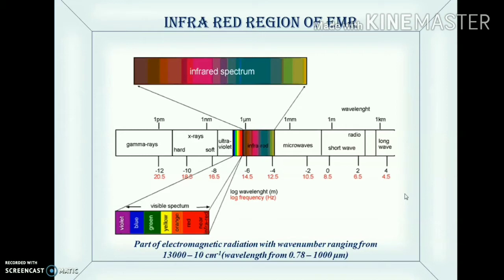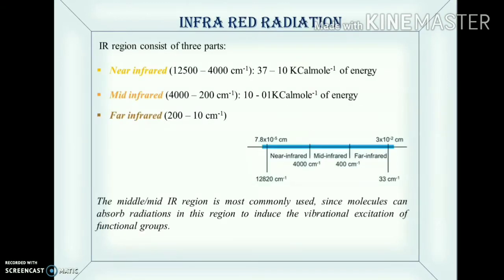And when I have come to know about the functional groups present in my substance, I can predict the properties and the nature of that substance. Along with the information regarding the functional groups, IR spectroscopy is also helpful to determine whether impurities are present with the substance or not. So what impurities are present can also be determined using IR spectroscopy. Now, let's see how it goes.